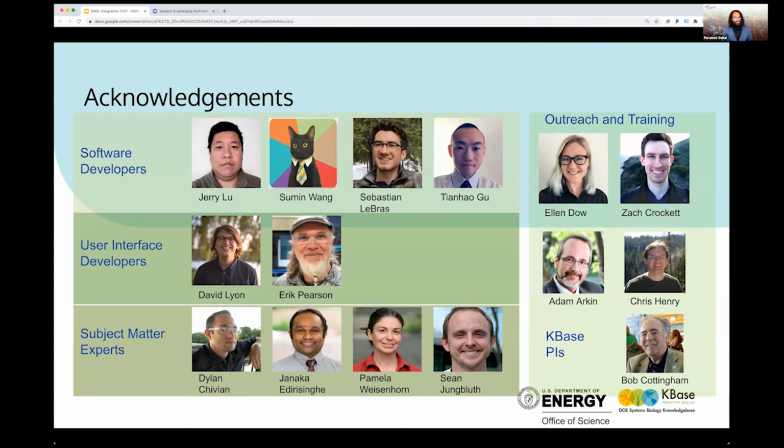We're trying to import data, like we did with Web of Microbes, bringing it in, standardizing it and making it easier to process, share and use in your own analysis. We haven't started looking at a lot of these other data sources like Algebase. But those are things that we would want to target as data compendia to bring into KBase and make it easier for users to use in our existing narratives.